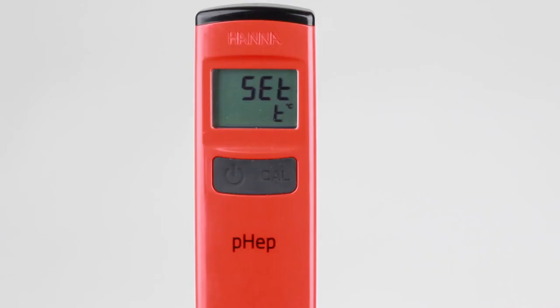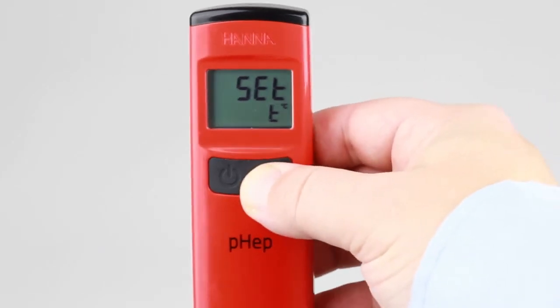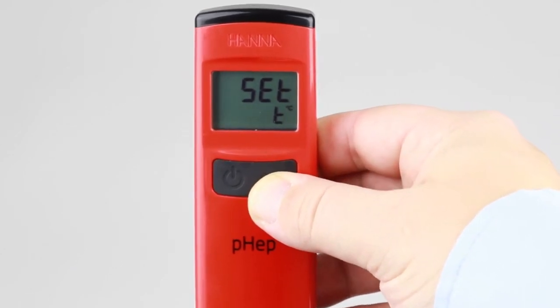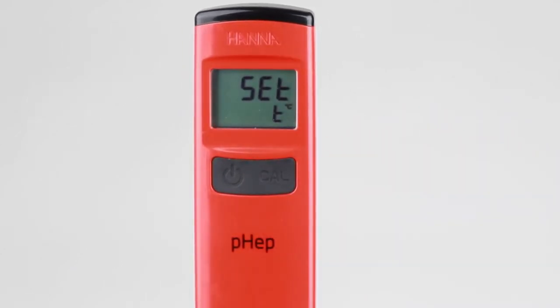The first setting displayed is a selection for temperature unit. At default, the temperature measurement unit is degrees Celsius. Pressing the Cal button changes the displayed unit to degrees Fahrenheit. Pressing the Cal button again changes it back to degrees Celsius.